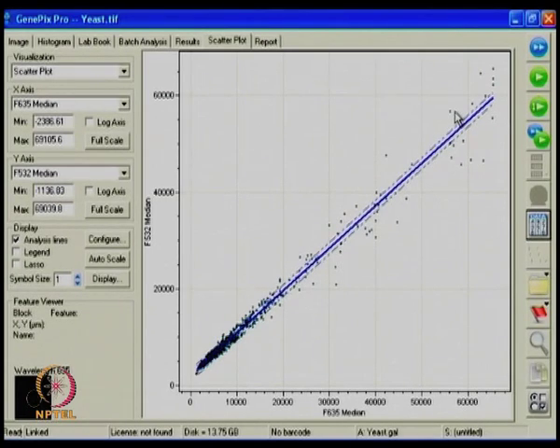The essential rule is that microarray assumes all the chips have spots, which are genes, that are not varying too much. So you expect most of them to stand near the origin, the center. This is what you want to look at: how closely they are aligned, which determines good aligned data. They should not be too far away from each other, because you expect a few differences but not very significant ones that can be seen at very large scales.